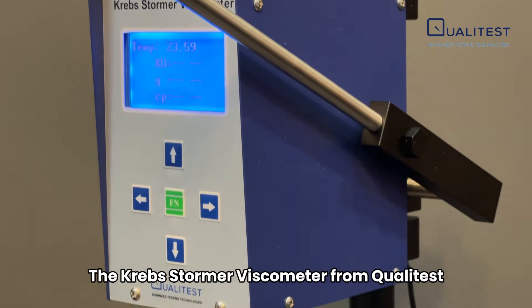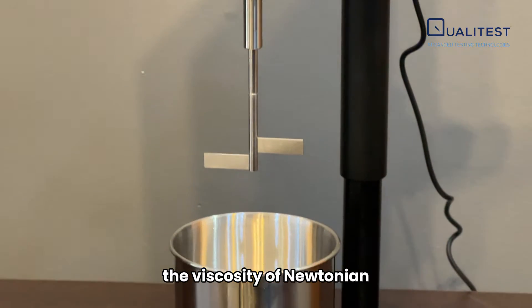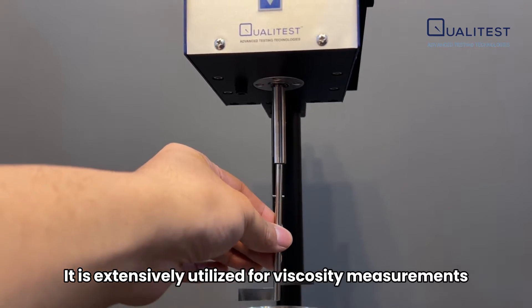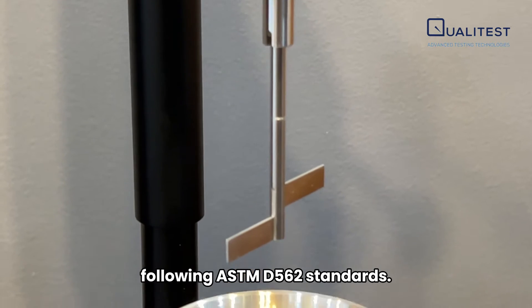The Krebs Stormer Viscometer from Qualitest is a versatile instrument specifically designed for accurately measuring the viscosity of Newtonian and non-Newtonian fluids. It is extensively utilized for viscosity measurements on paints and coatings following ASTM D562 standards.